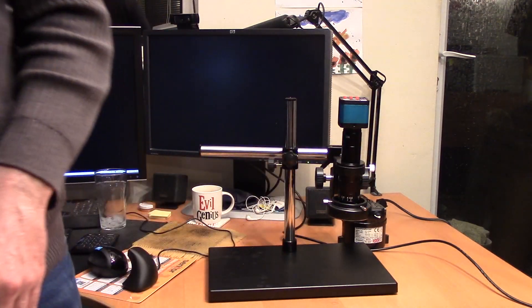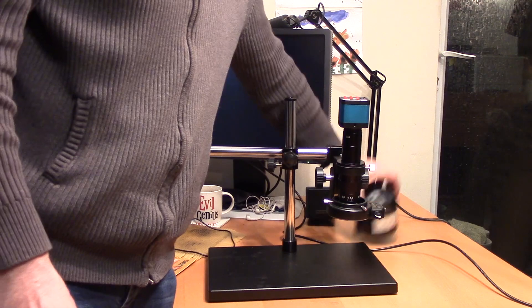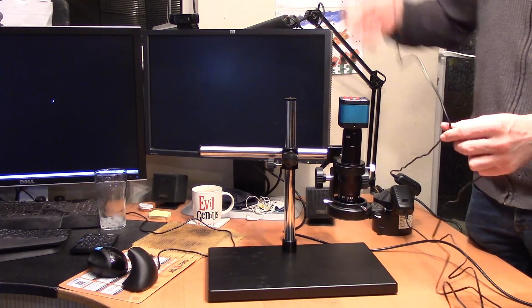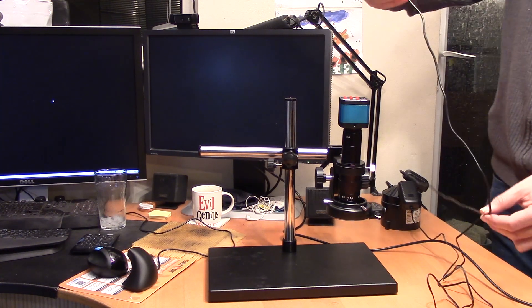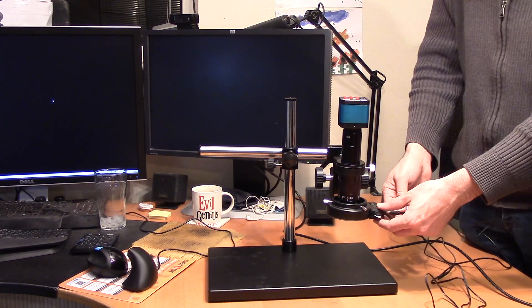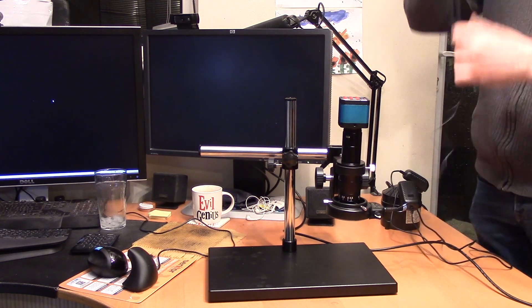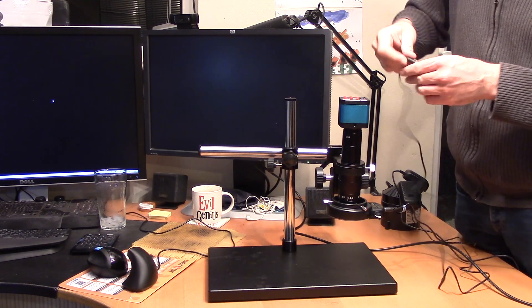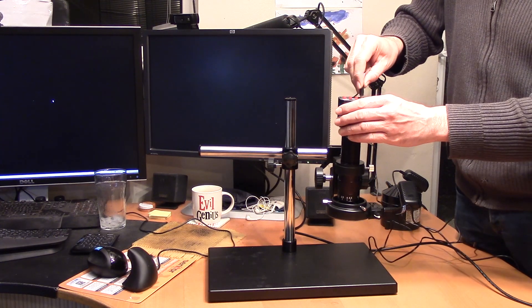So I'm not going to use them. I've got an auto transformer with US-style sockets on it, so I'll use that instead. The cables on these are really not very generous at all — the one for the ring light is perhaps a metre and a half from the wall socket, so not great. The one for the microscope is not quite so bad, but you still need a power socket very close to where you're working.